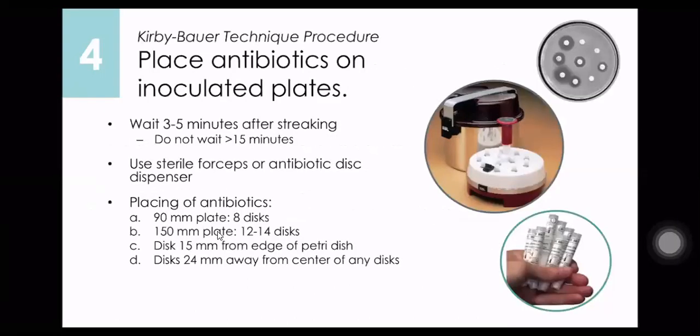Okay, so we need to place the antibiotics on the inoculated plates. So what do we do? Wait 3 to 5 minutes after streaking. Do not rush to place the antibiotic disc right after you streak 3 times. You do not wait greater than 15 minutes, however, before placing the antibiotics, because there is a tendency that what you streaked will dry out.